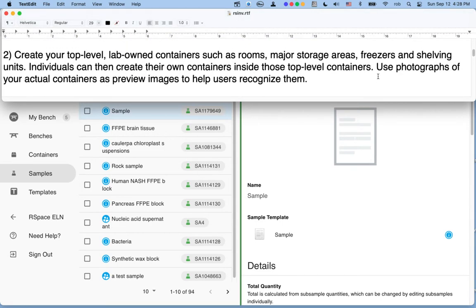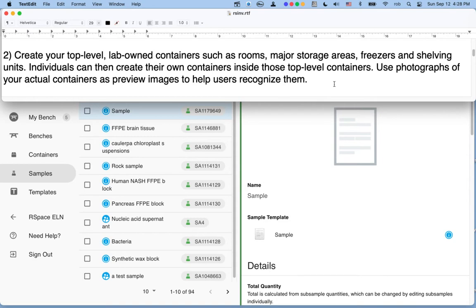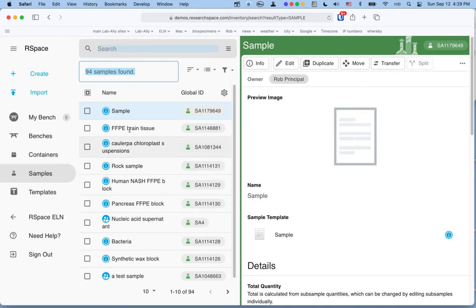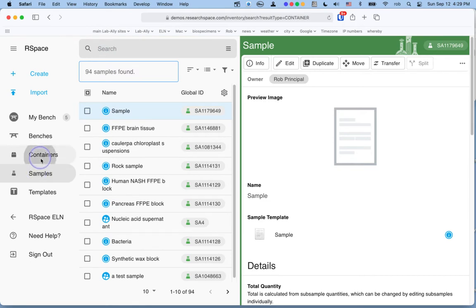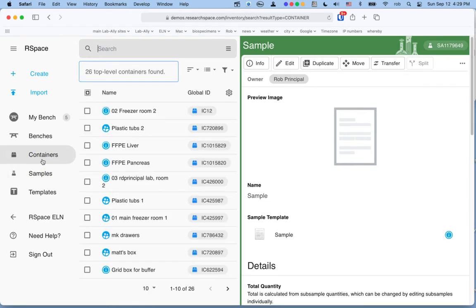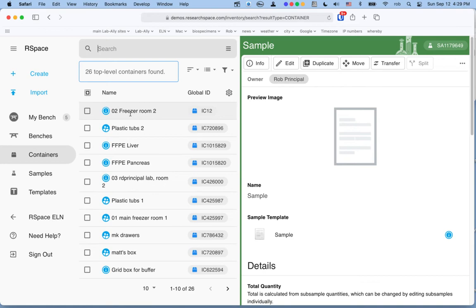Once you've got some idea of how the system is working, the next thing you'll want to do is go ahead and set up your top-level containers. The way that you'll do that is in the navigational tree and in the sidebar or control panel over here, you'll see that you can choose to look at either samples or you can choose to look at containers. If you're new to the system, this list of containers will be largely empty. The first thing you'll probably want to do is set up your large-scale containers, also called top-level containers.